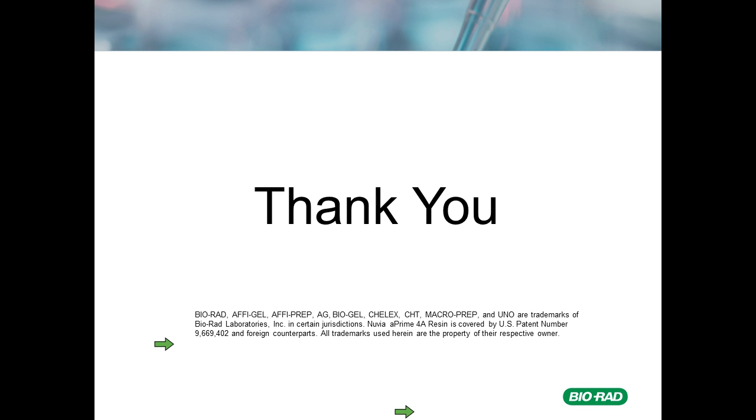Okay. So for plant-based vaccines, what recommendations do you have for purification? Yeah, that's another good question. So I definitely recommend ion exchange for the capture step, again, because the binding capacities tend to be really, really high, and typically plant supernatants tend to be a little dirtier compared to other supernatants. So ion exchange can frequently be used with some aggressive washes as well to get rid of some of those contaminants.